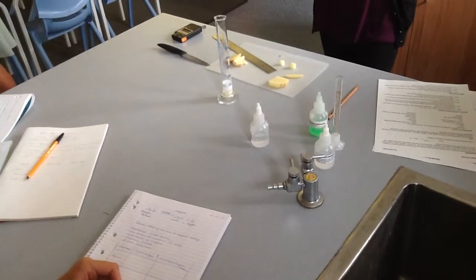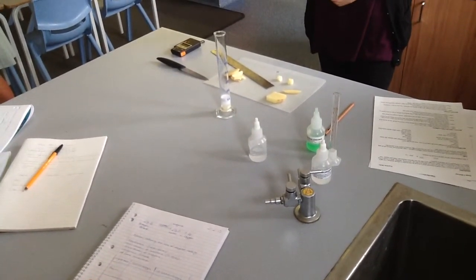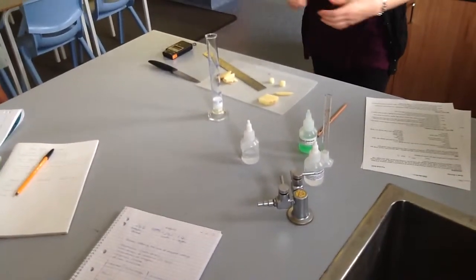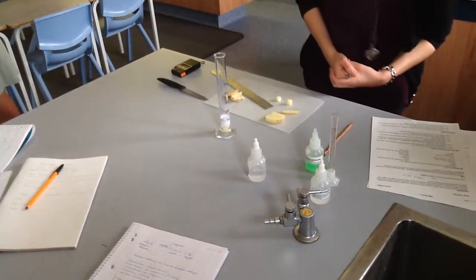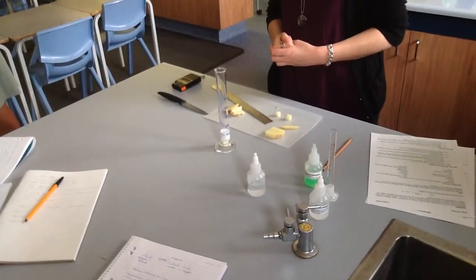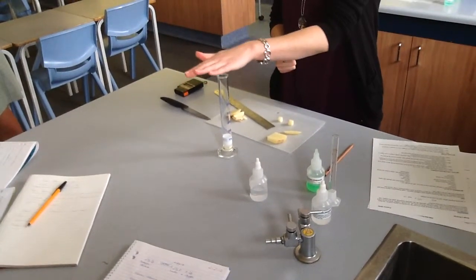Okay. So you might need to vary how long it's in there. You might need to vary the size of your measuring cylinder, or the concentration, depending on the factor you want to test and how clearly you want to be able to see the amount of oxygen that's been produced. But as you can see, that's quite a simple method to do.